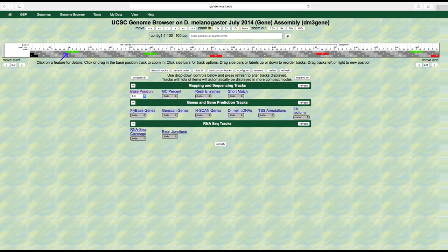Some boxes are labeled green — these are for the amino acid methionine. Translation always starts at a codon that codes for methionine, which almost always has the sequence ATG. The red boxes indicate stop codons; for example, TAA calls for an end to translation.